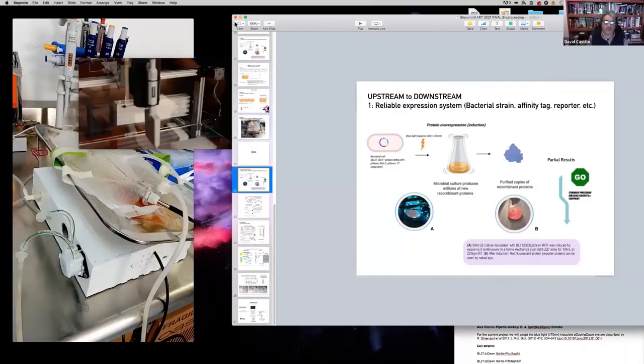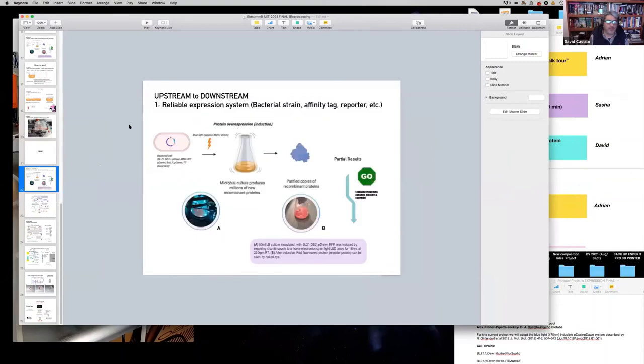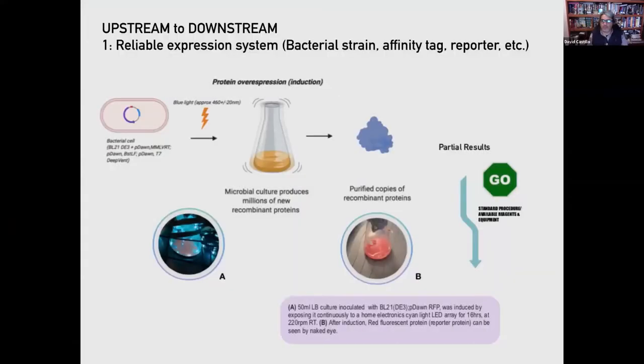Oh, fantastic. Well, I can finalize the other point, which is actually very quick: discussing a little bit of the options that you might have whenever you're running your protein expression. So I go back to the presentation. If you decide to choose this light inducible system that we have tested, there are also many options. I think another speaker from last year presented a similar system, a miniaturized system for producing proteins or other types of biomolecules using light.